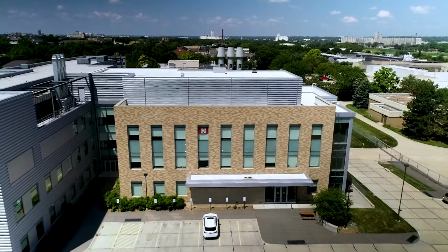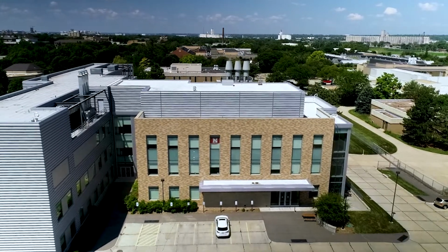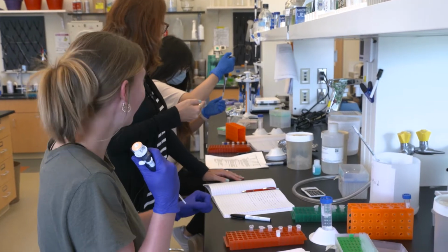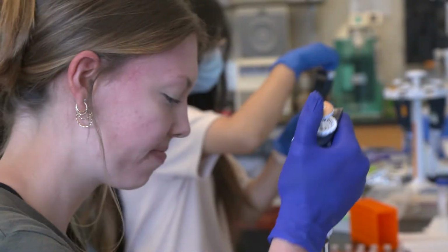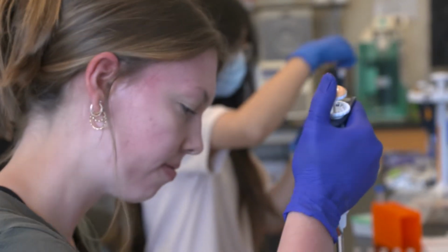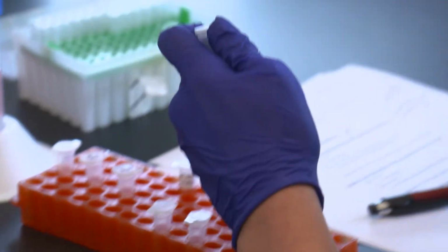Well, welcome. This is my lab, or the Pannier Lab for Engineering Biomaterials and Gene Delivery. We're located on the 3rd floor of the north wing of the Morrison Life Science Center. And right now we're in what we call our main lab space, where we do a lot of research into designing materials to deliver genes or nucleic acids into cells, including stem cells, as well as for vaccine technology, similar technology that's used in the COVID-19 vaccines.